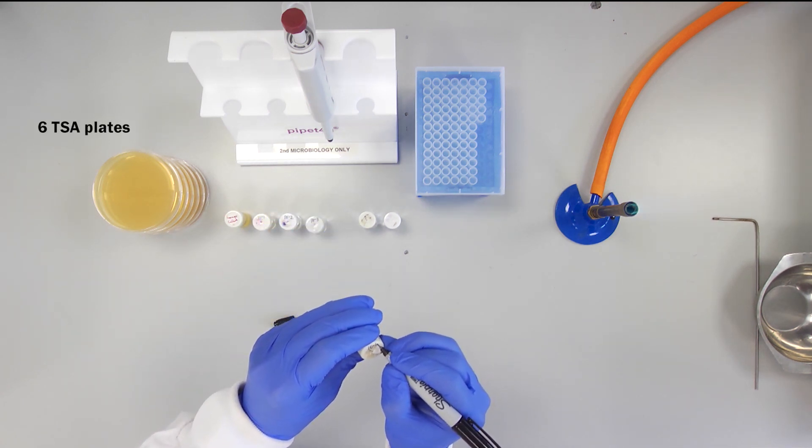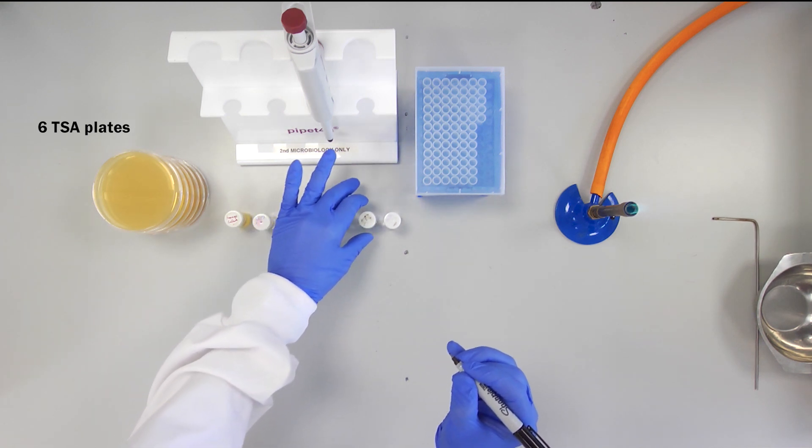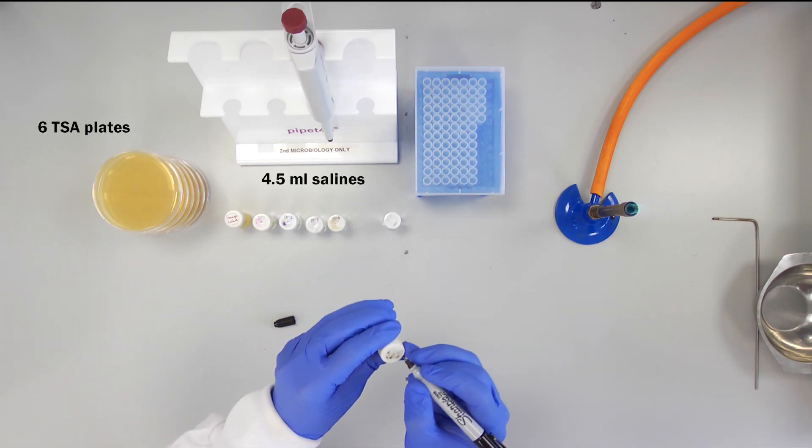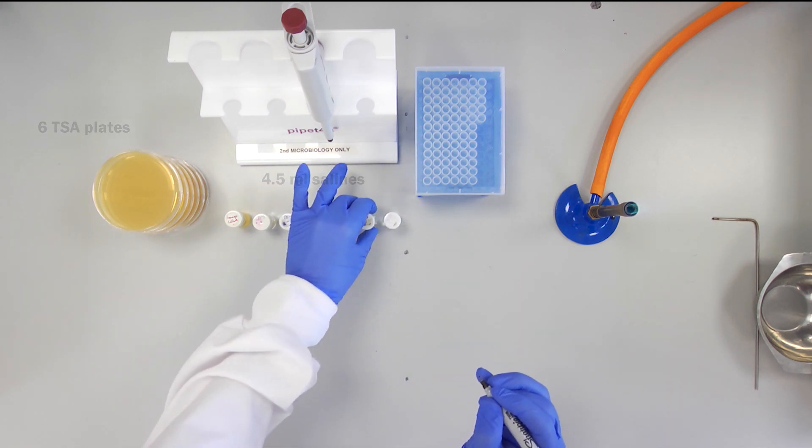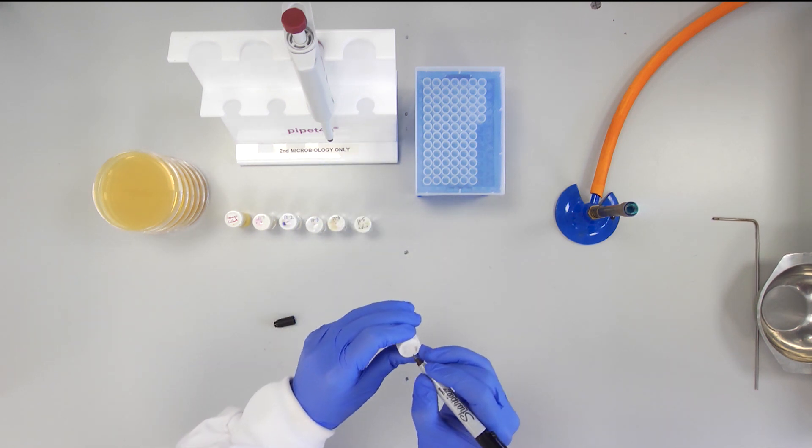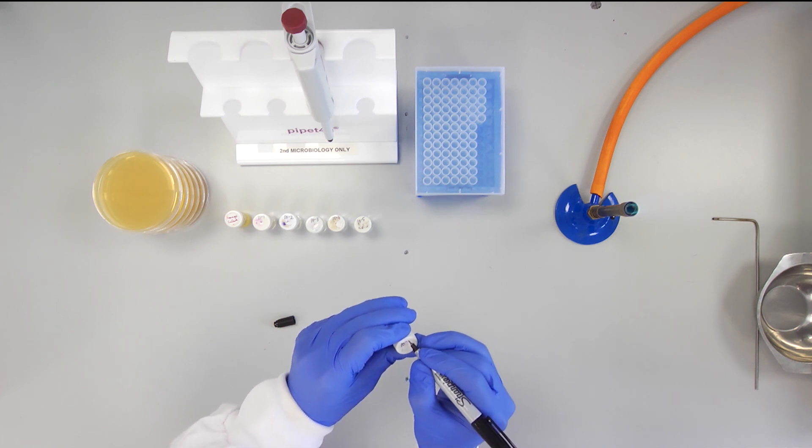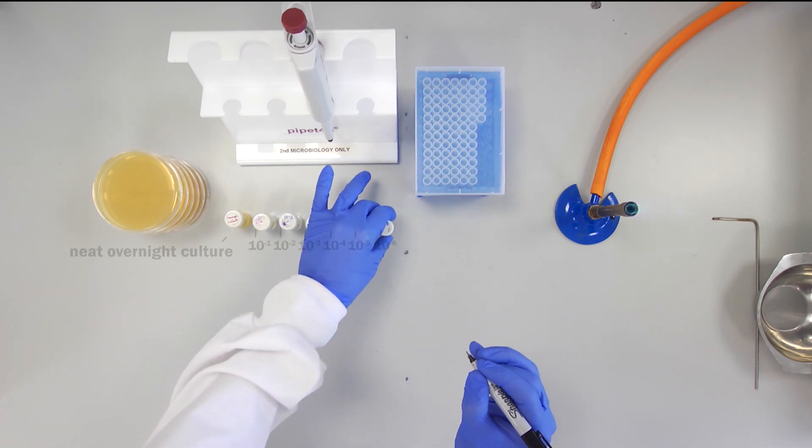Six TSA plates and six sterile 4.5 ml saline bijoux. Label the top of each bijoux with the dilutions from 10 to the minus 1 to 10 to the minus 6.